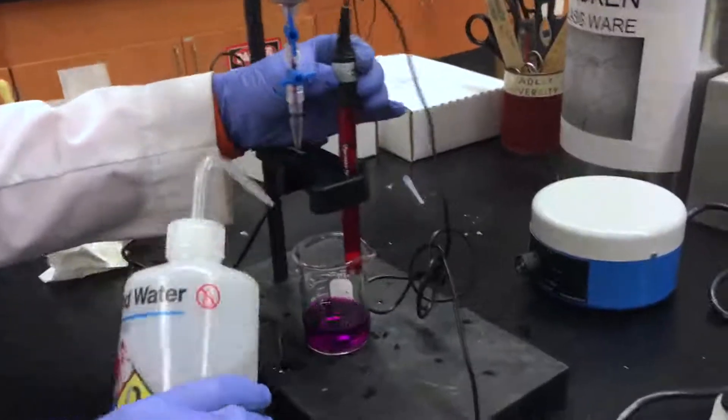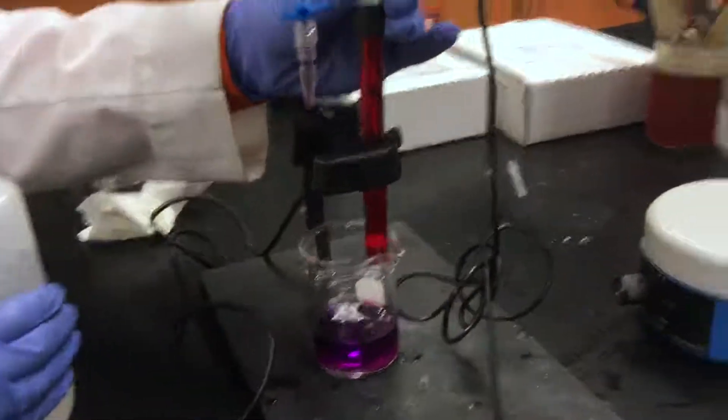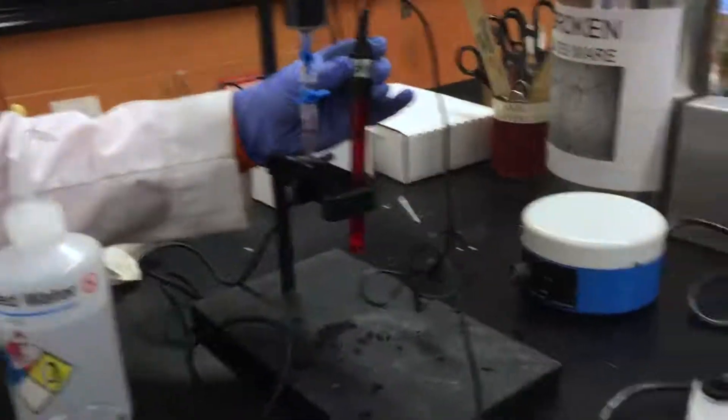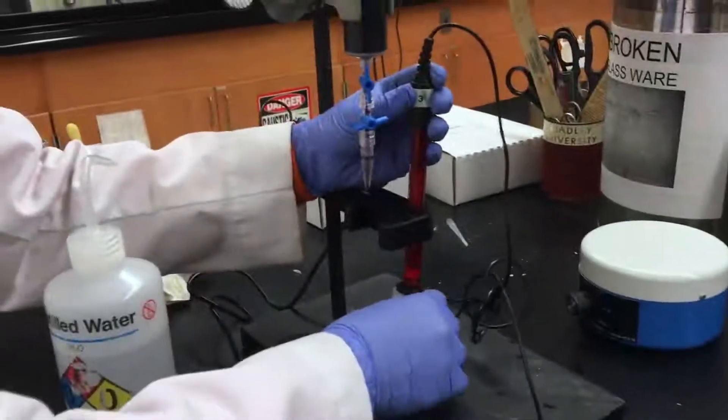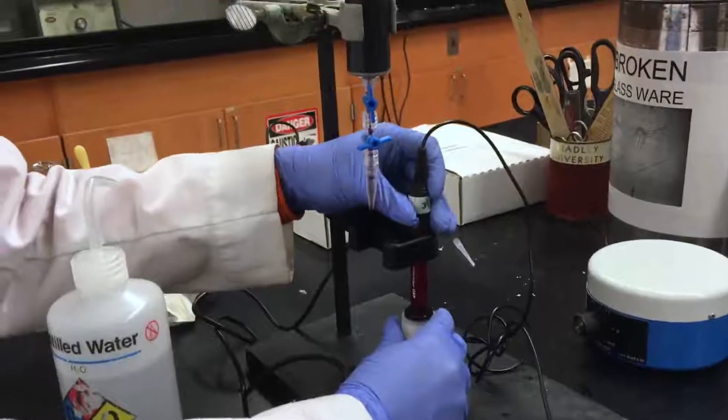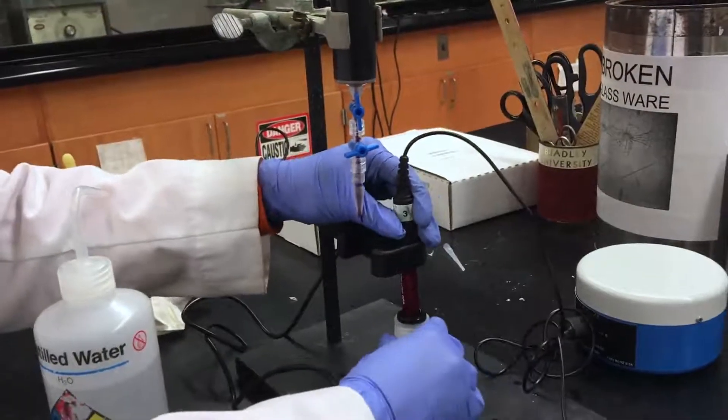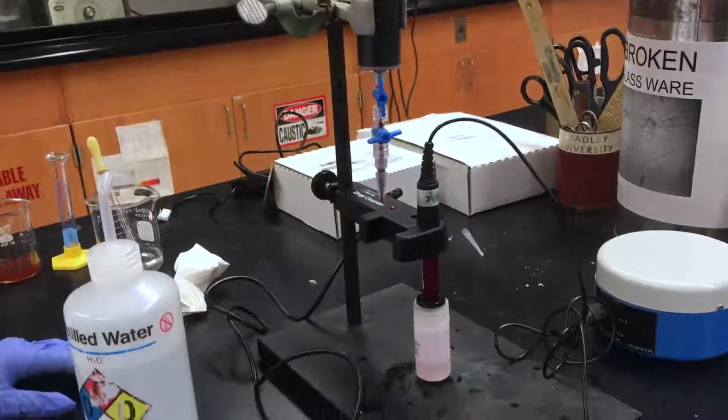So now the titration is done. Eilish is going to take the probe out again and clean it with the DI water. And then we're going to put it back into the buffer solution for storage purposes. And then you're going to discard your sample as the lab states. And clean up anything else that you need to.